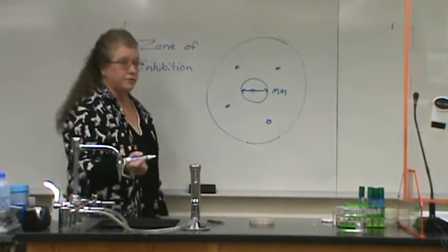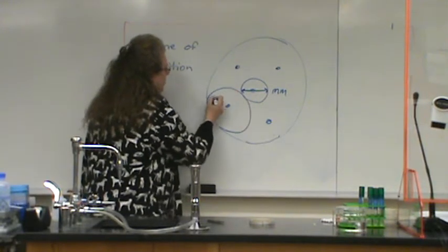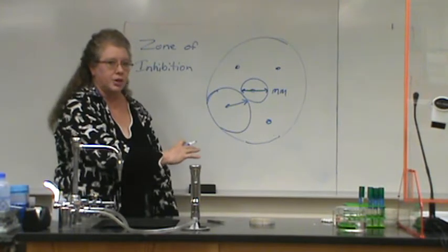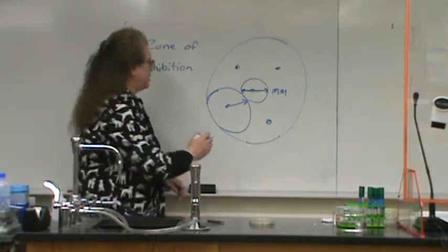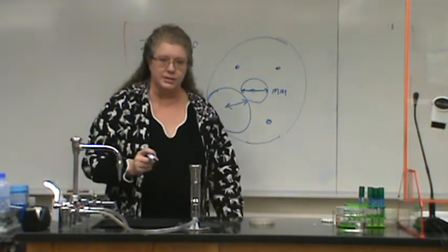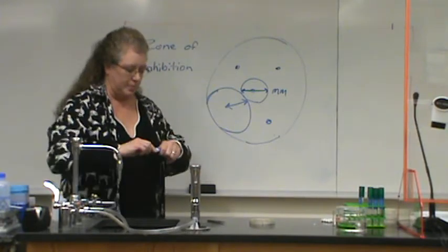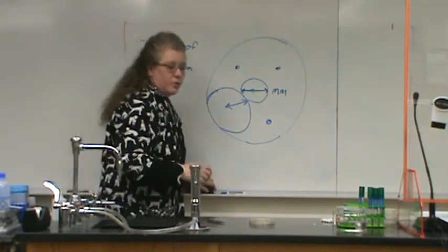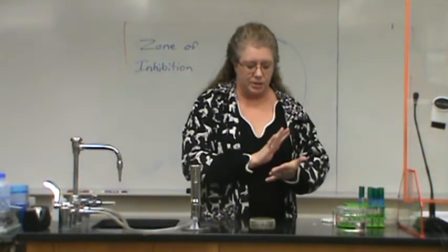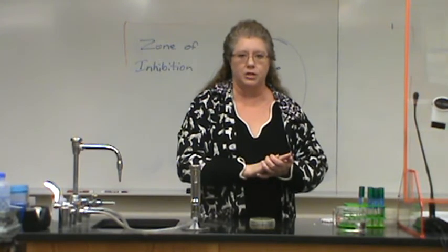If, for some reason, you can only count one side because the other side ran into either another zone of inhibition or the side, you can measure the radius and multiply it by 2, because that will equal the diameter. So that goes over the Kirby-Bauer method, and the results section is also listed in a separate handout to allow you to come up with interpretation.